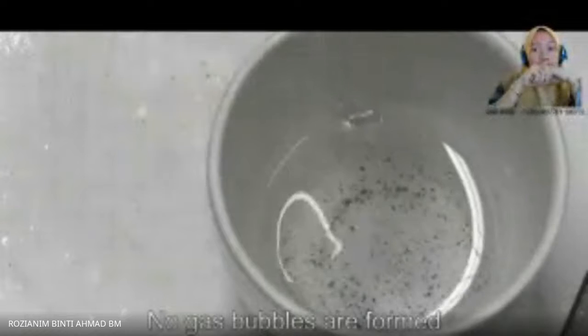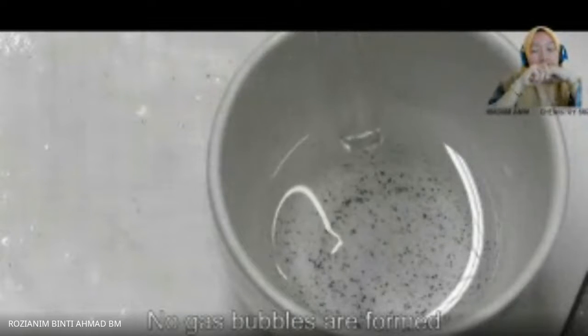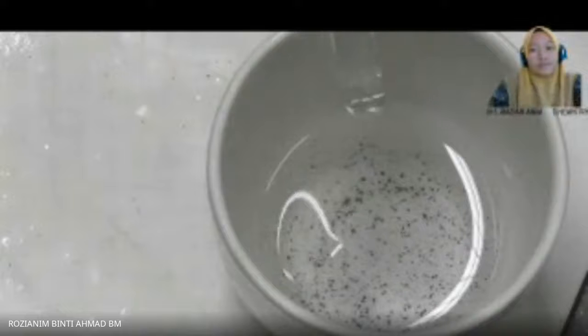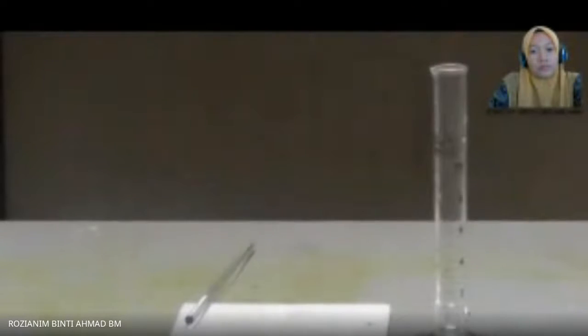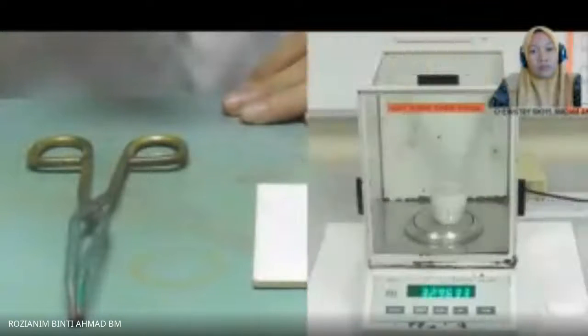No gas bubbles are formed on the surface of the solid. Most probably, all zinc has reacted. Adding too much hydrochloric acid will only make it longer to dry the mixture.